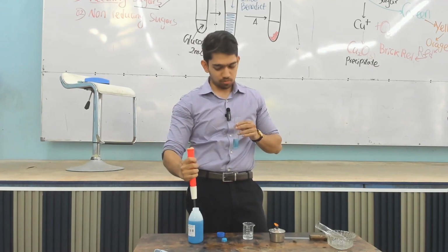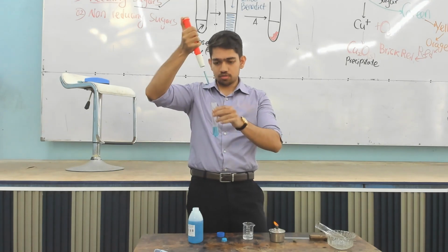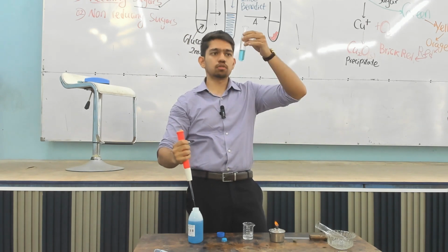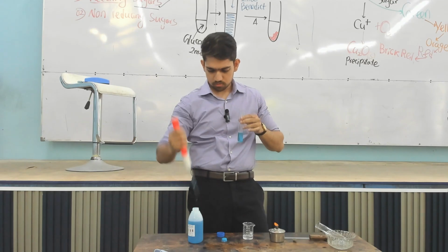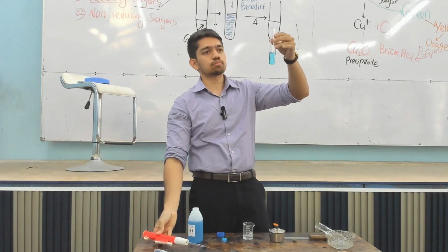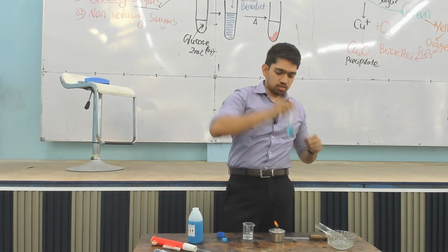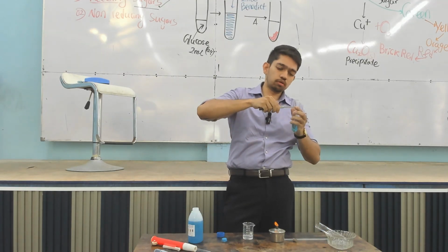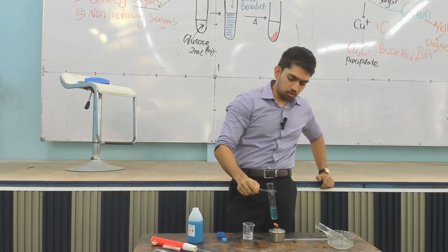The pipette is very small, right? I have to use it several times. It doesn't have to be 2 milliliters. It just has to be equal volumes. Okay, equal volume. So you hold it with the test tube holder, and then you heat it.